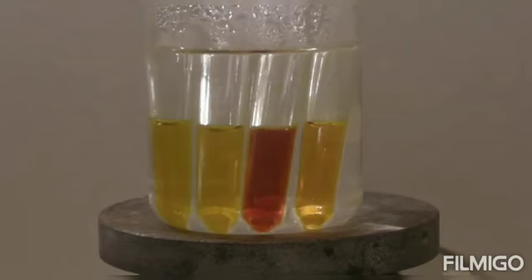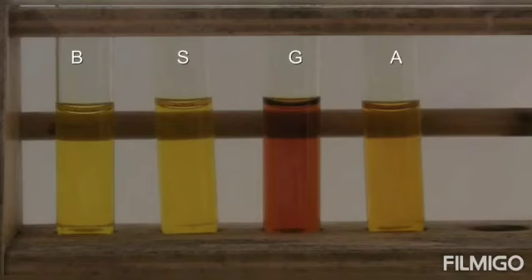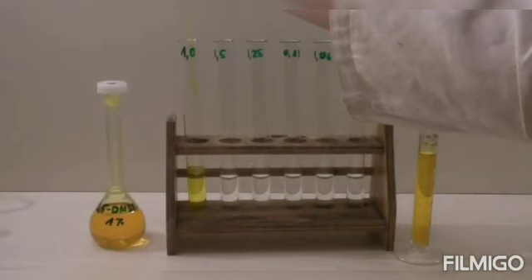After providing the heating, here we can observe the change in color. This is the observation. Here only one test tube, that is the test tube containing glucose, shows a different color. The color changes from yellow color to reddish brown color due to the presence of glucose. Therefore, this test is only for the detection of glucose.